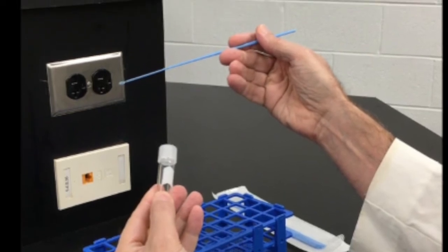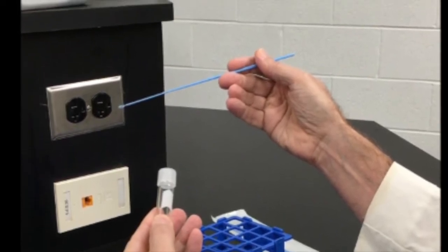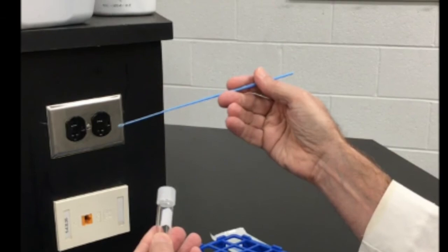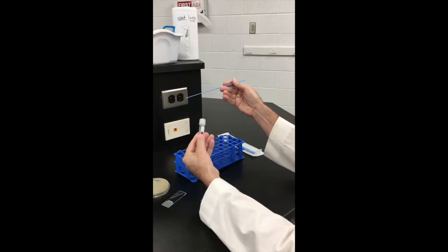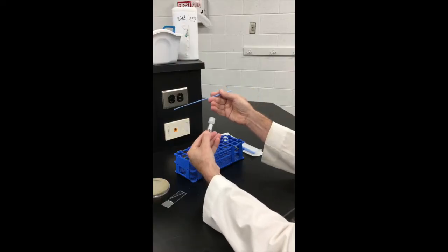Hold your loop in your other hand as shown, roughly the way you might hold a pencil. This leaves the little fingers of that hand free. You should use those to hold the cap of the tube.